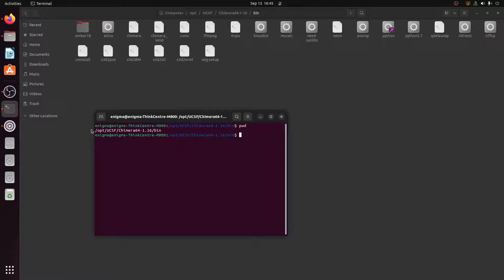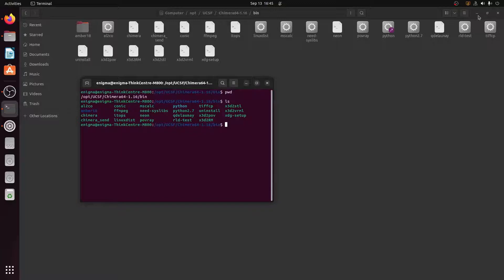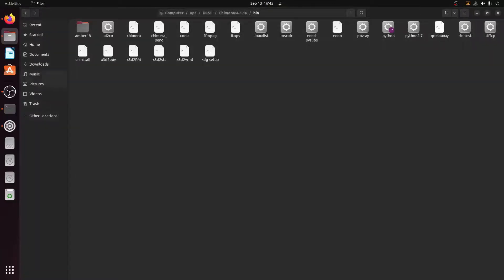The pwd command tells me we are in the folder: /opt/ucsf-chimera/chimera/bin. Inside this bin folder we have Chimera located. I can also type 'ls' and hit enter to confirm. This is the location we are interested in, so I'll keep this terminal open.